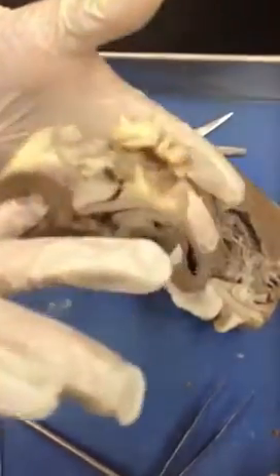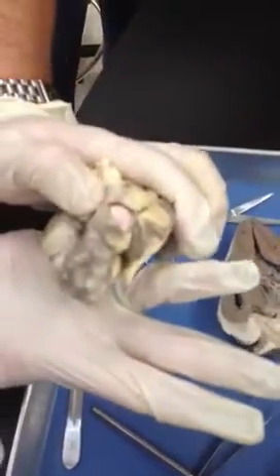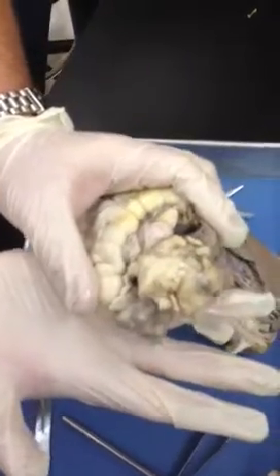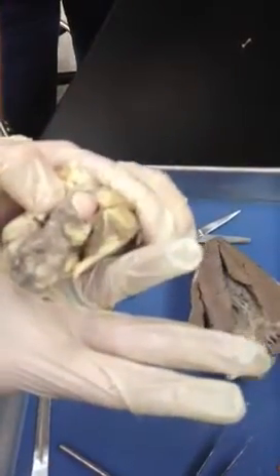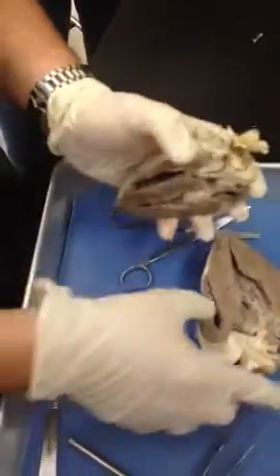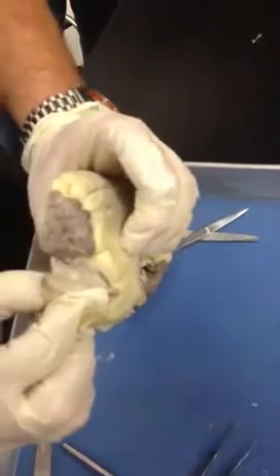If we go through the tricuspid valve, we are in the right atrium. We got here via the superior vena cava and the inferior vena cava, both returning blood — the inferior from the lower extremities and the abdomen, and the superior from the upper body, the arms and the head. We go from the right atrium into the right ventricle, and from the right ventricle through the pulmonary trunk, which is in between the auricles.